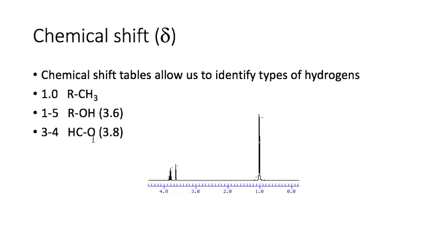And if we were to find out that this molecule only has one oxygen, then we'd also know that there's another hydrogen on the other side of that, and we would have a group of 4 atoms in a row: hydrogen to carbon, carbon to oxygen, oxygen to hydrogen for an alcohol grouping. So that's important information.